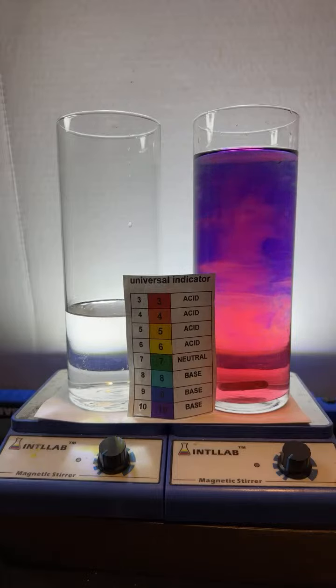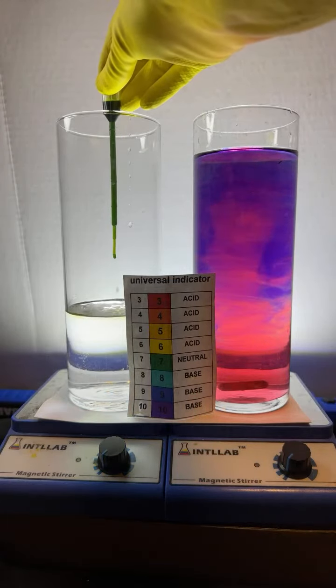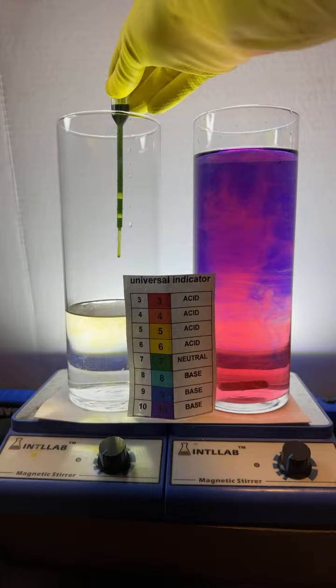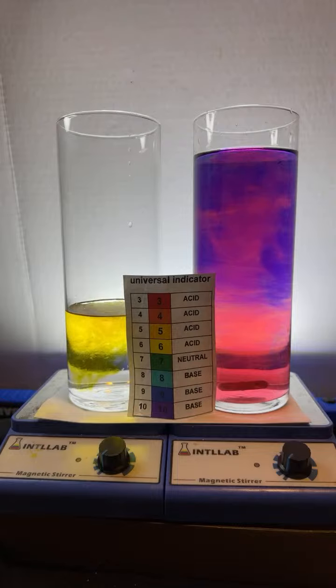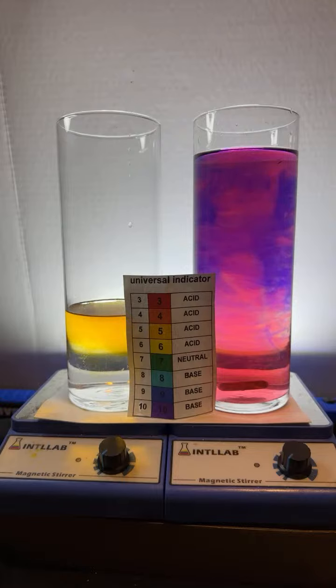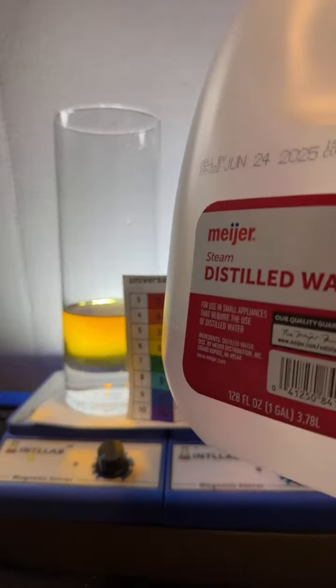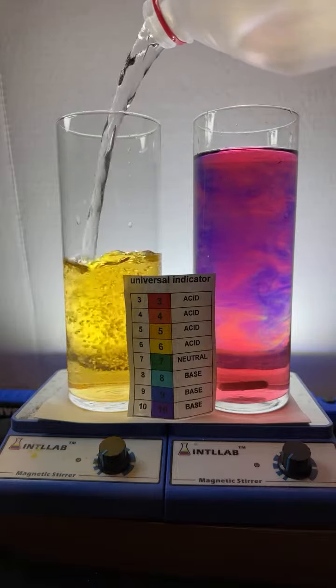You got it. I was talking about the changes in the electronic density of the molecule. That's what's going on. You're going to change the absorption spectrum. So notice the universal indicator in the vial is green. And when I add it to the water, this is pure water. I mean, no water is entirely pure, but this is distilled water, which is very pure. It's yellow, which is pH 6. That's an acid. What the heck is going on with water that's pure? Distilled water. What is going on with that stuff being slightly acidic?